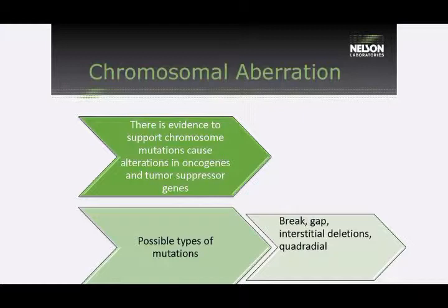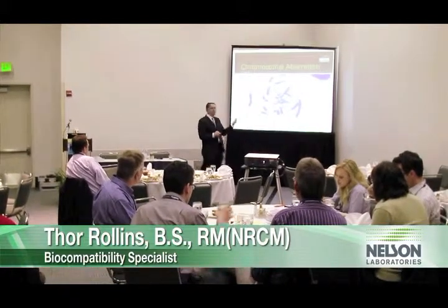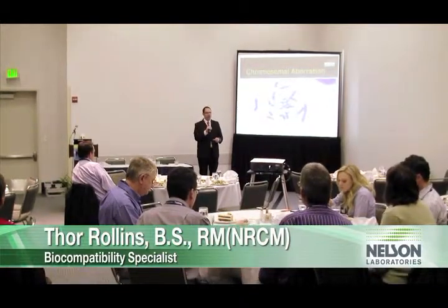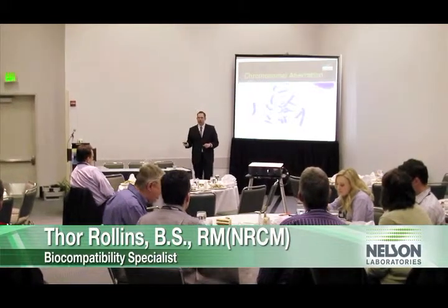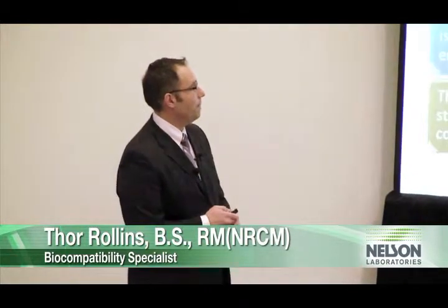So now that we have the cells broken apart and we're looking at the chromosomes, we actually sit there and count how many aberrations your test cells have compared to the control cells. Okay? So we have someone underneath the microscope just counting the aberrations. A lot of counting microscope work. But then, after we get the counts and the types of aberrations, we compare those counts to the negative controls. And if you have a statistically higher number of aberrations compared to the controls, then once again, you're considered a possible mutagen. Okay? So that's chromosome aberration.